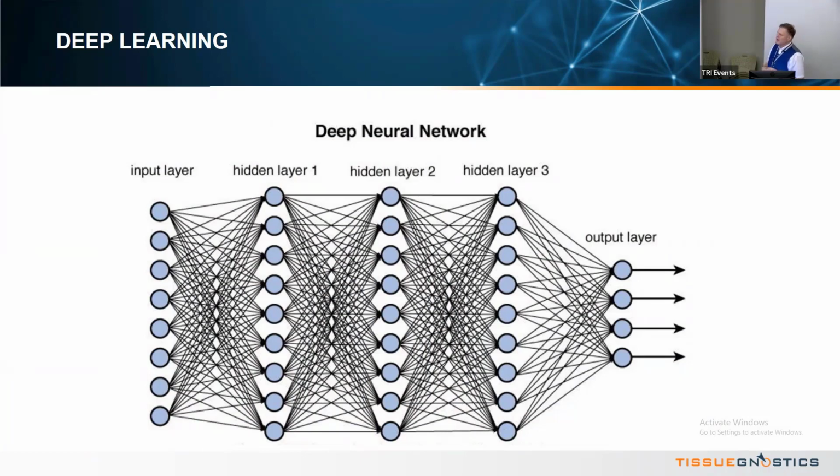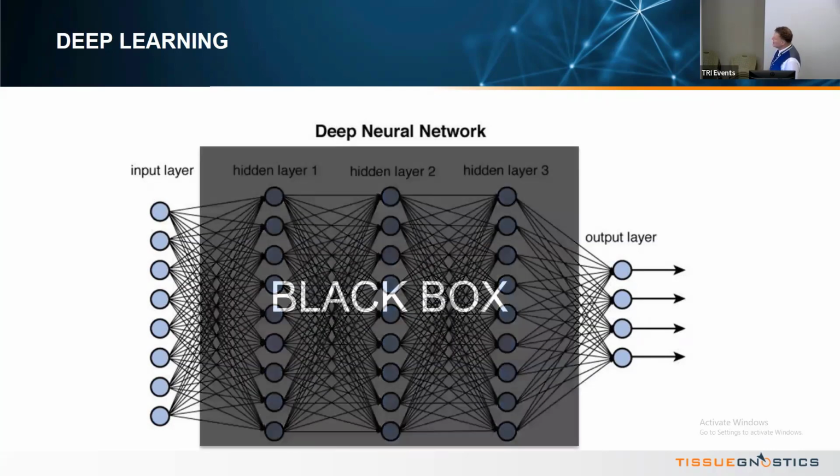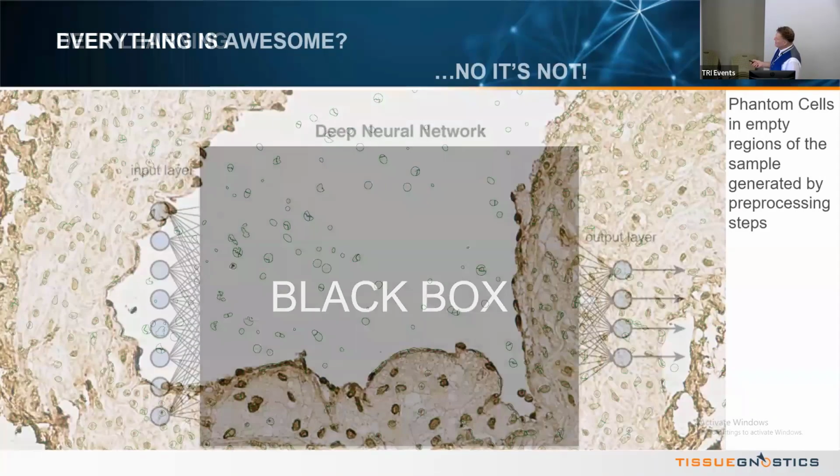Nowadays, you find many published deep learning algorithms, open source, and you can use them and modify them, but it's always the same story. You define the input, you may change the algorithm so that different interconnections appear, but as humans, we hardly understand what really happens. Then we see what comes out. This is the black box I'm referring to.